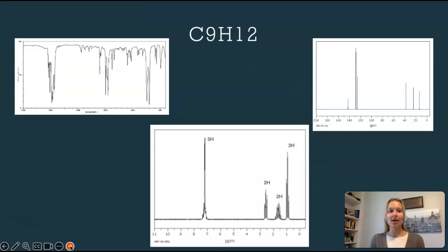On this slide, we see our molecular formula, which is C9H12, but we are unsure of the structure this chemical formula represents. This project has asked me to identify the structure that matches this chemical formula using the data that is provided. 3 data sets were given to help us solve this unknown compound: an IR spectra, 13C NMR, and 1H NMR spectra.